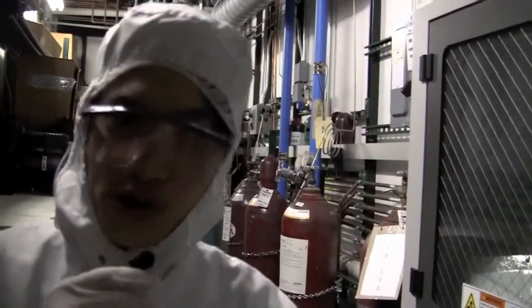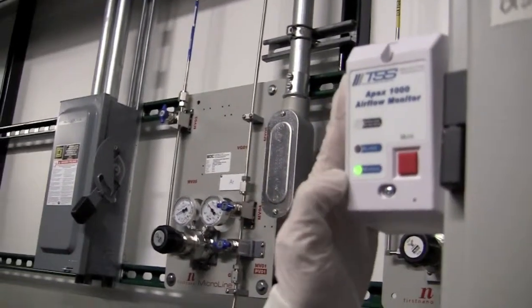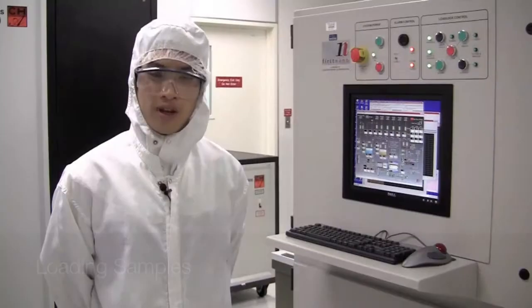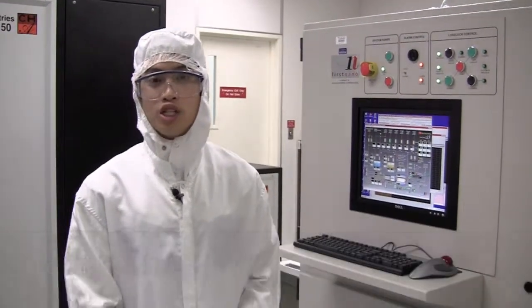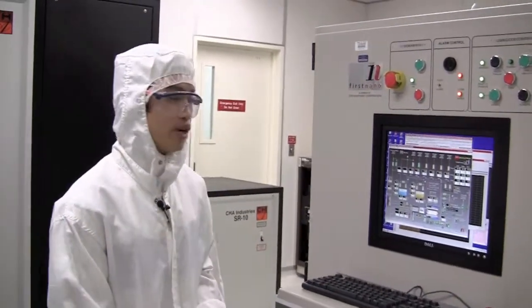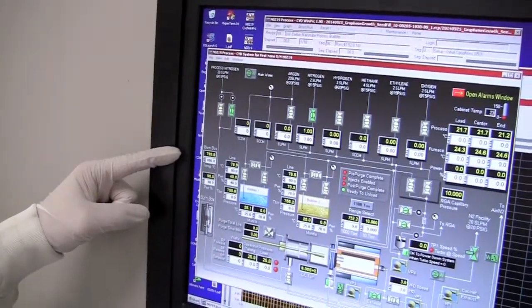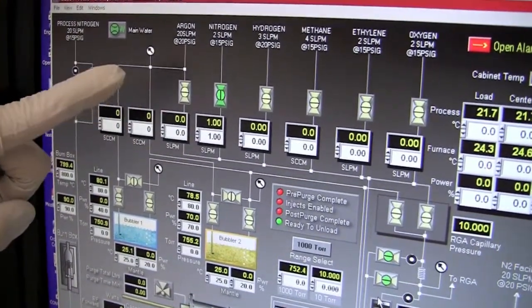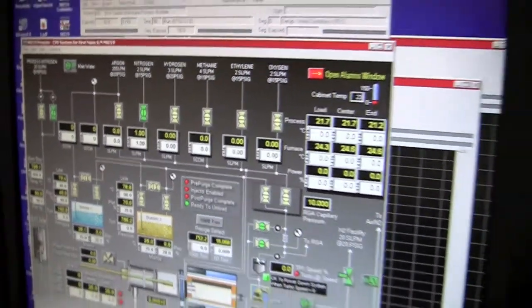The final aspect to make sure the CVD furnace is ready to use is to check this box here. A green light says the exhaust is working correctly and we're ready to run our recipe. Now that we've verified gas cylinders, water chiller, and burn box are on, we can begin. We want to note that nitrogen is flowing, purging our system, but no other lines are flowing gas right now. That's what we want when we load samples.